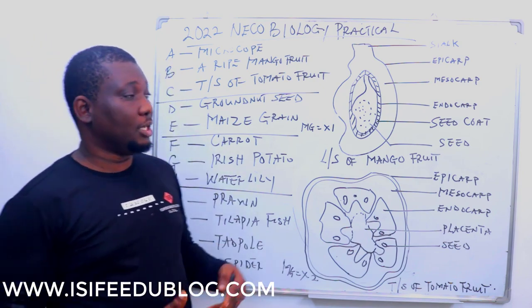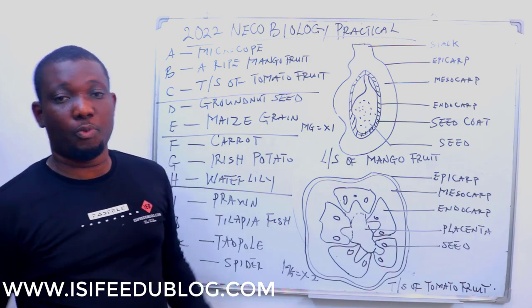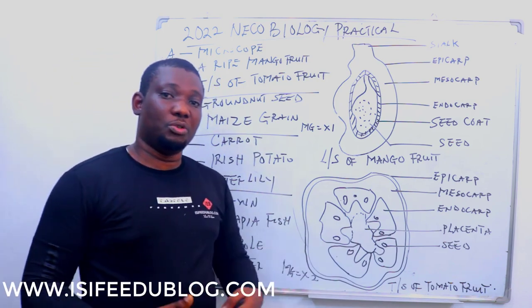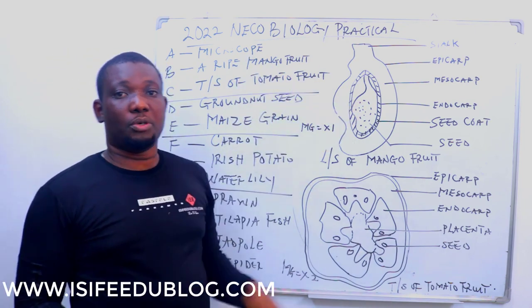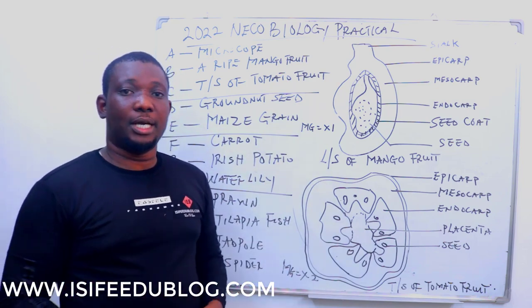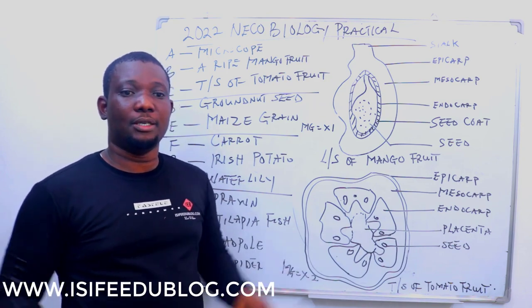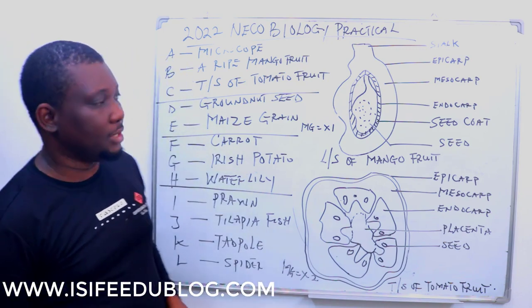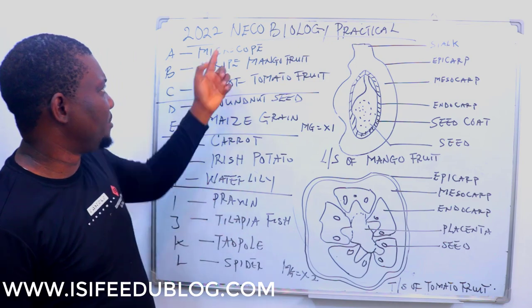Because the role of the microscope in the microbiological field, when we're talking about microbiology, most microorganisms under investigation, we usually investigate microorganisms using a microscope, because a microscope is an optical instrument that can magnify organisms that cannot be ordinarily seen with our naked eye. So with the aid of a microscope, these organisms are well seen. Okay, these are the introductory parts of a microscope.